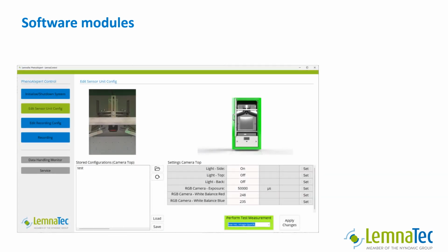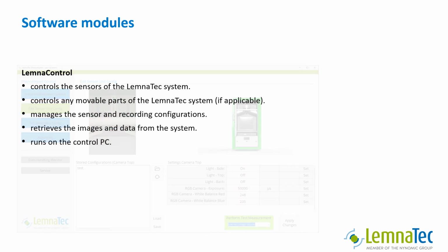First is Lemna Control. Lemna Control controls the sensors of the LemnaTec system and any movable parts. It manages the sensor and recording configurations and retrieves the images and data from the system. Lemna Control runs on the control PC.